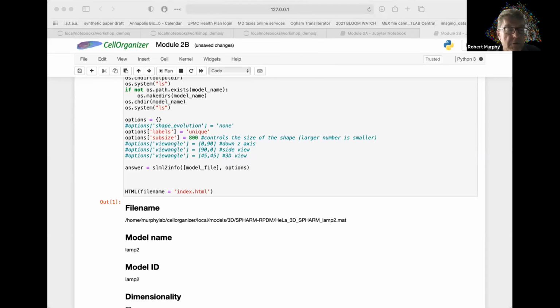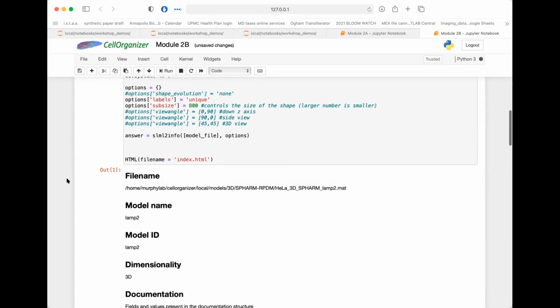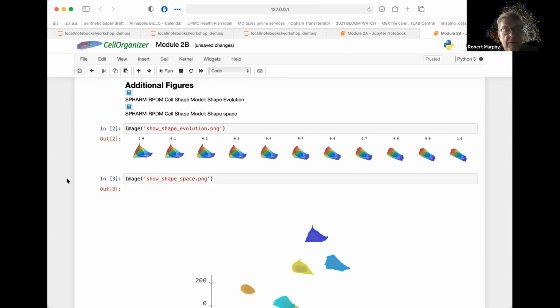When you click on download files, you then have to run it. Okay, I click on download the files. Then that opens up a notebook, yes, and then you have to run the notebook. Oh, okay, got it. I'm sorry, I've never run Jupyter notebooks. I've heard a lot about them. So I click run, and nothing happens. It should start downloading. Okay, it says retrieving, creating directory home of your local models.